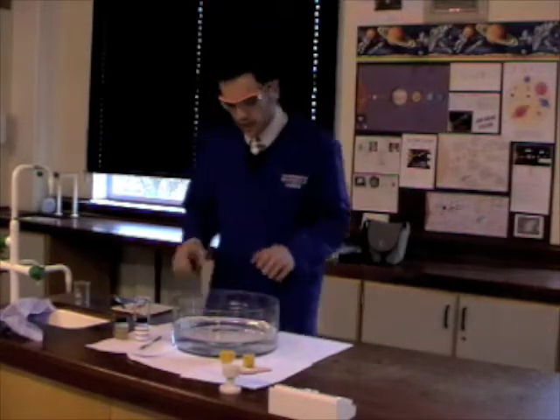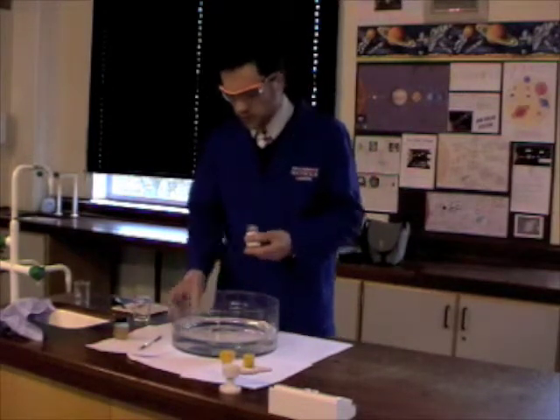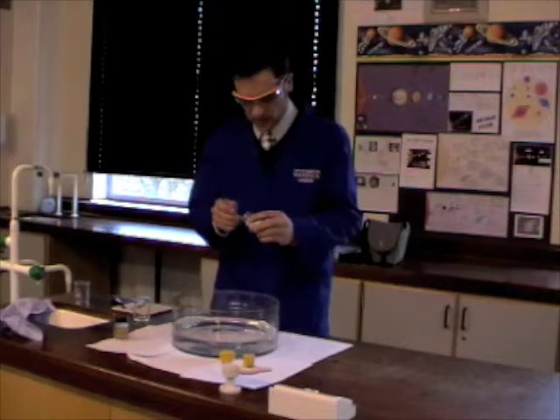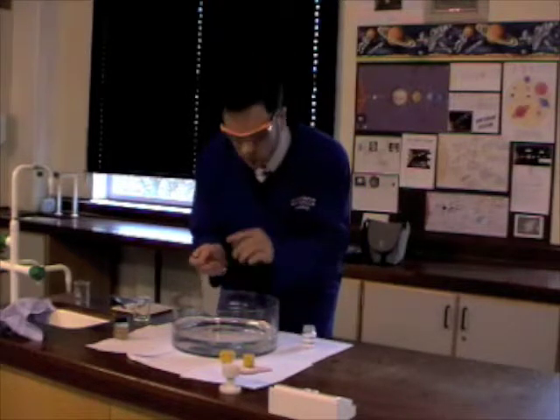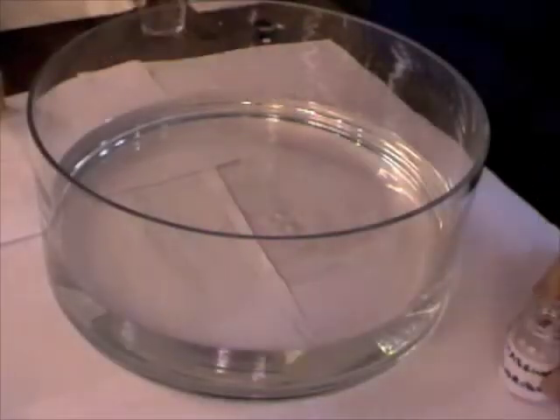The next one I'm going to look at, how well potassium chloride reacts with the water. If you know what common table salt is, that's sodium chloride, you might have an idea of what's going to happen here. I've only used this really small little amount, so it's comparable with the reaction that I did with the potassium metal. So I'm going to add that to my water.